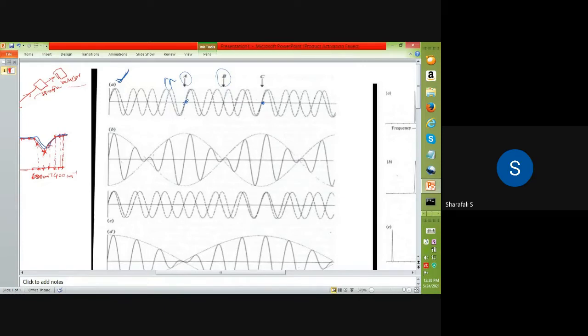And we'll get different maxima and minima. That is figure 2. After interference, we'll get an intensity pattern like this with respect to time. So all these things are with respect to time. This axis is time. With respect to time, we have a different intensity because of the action of interference.